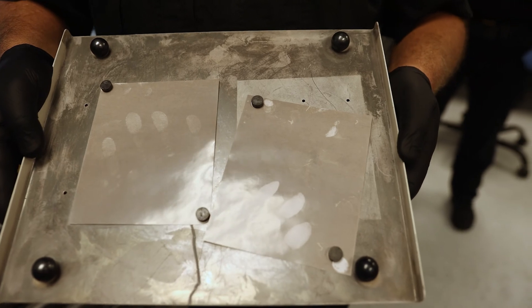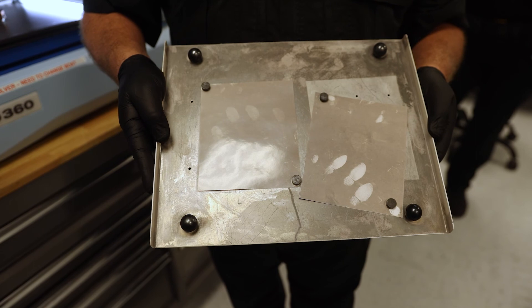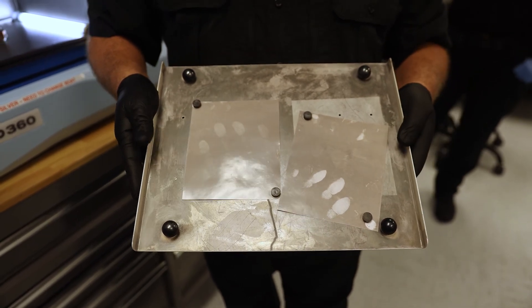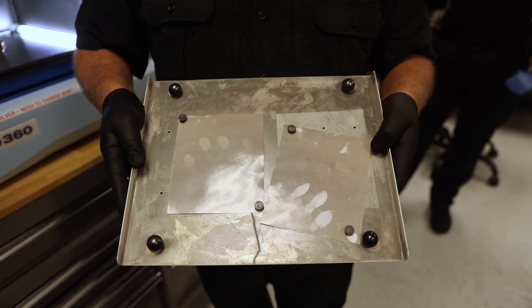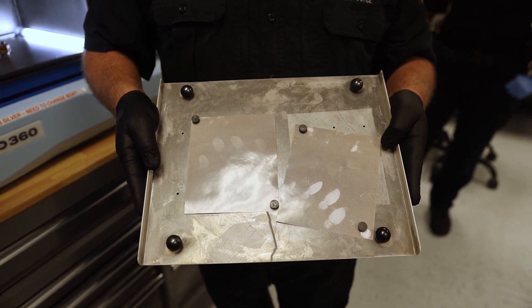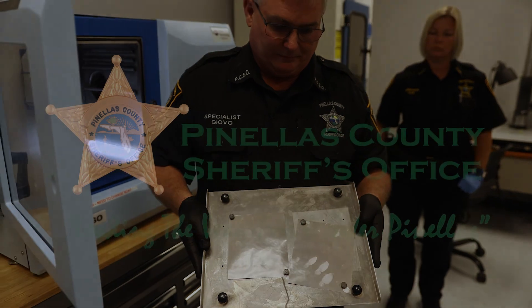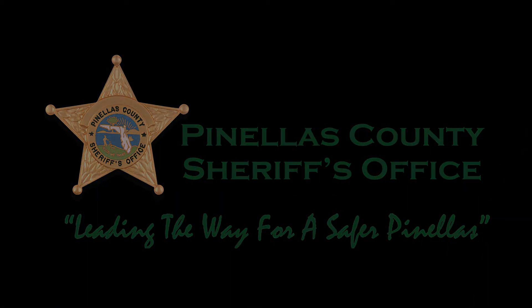At this point, you can see the development of the fingerprints on the surface, on the substrate. There are different processes that we could do after this. You'd want to photograph the fingerprints so those photographs could be turned into AFIS for examination. Or it might be an item where we would use an alternate light source to see possible fingerprints that developed on the surface.